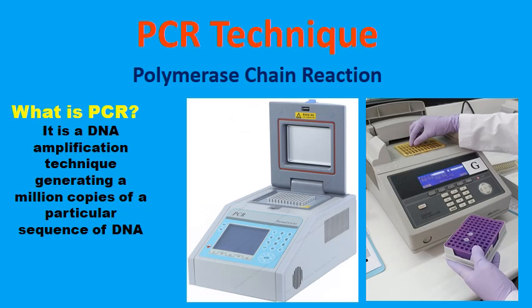Everyone, this video speaks about a really interesting technique widely used nowadays, which is called PCR, polymerase chain reaction. I'm going to speak about the principles and the technique procedure. What is PCR? It is a DNA amplification technique, generating millions of copies of a particular DNA sequence.